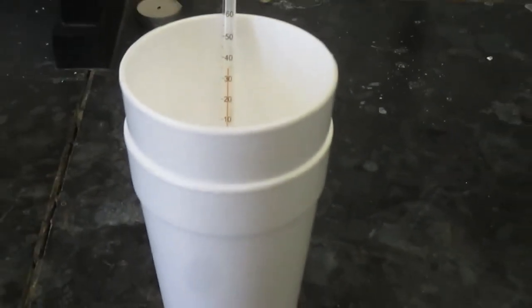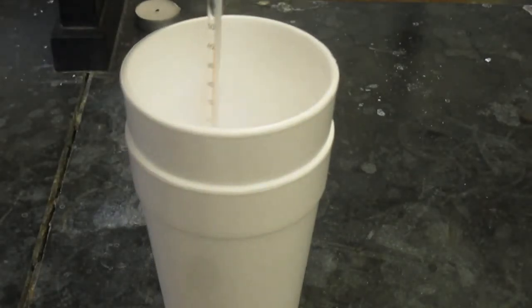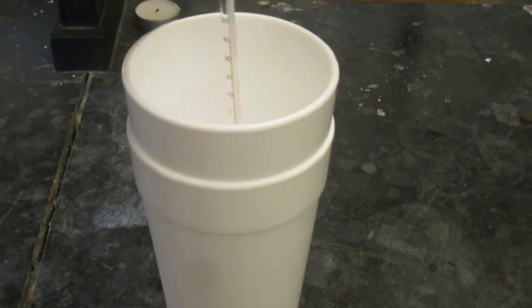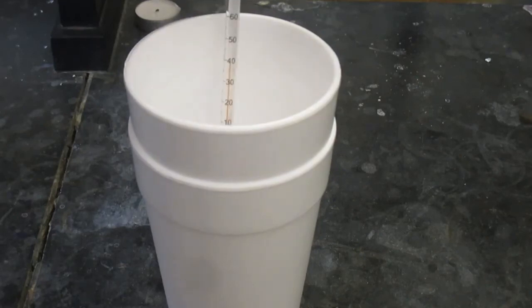But I'll tell you right now, it has surpassed 30 degrees Celsius, and it continues to rise, and it's almost up to 40 degrees Celsius, and it's continuing to rise. I'm going to stir it up, and we're going to continue doing this until all of the magnesium is dissolved in the reaction.